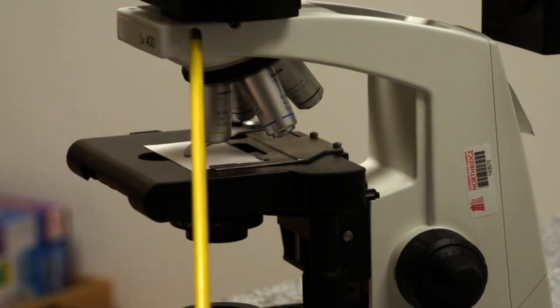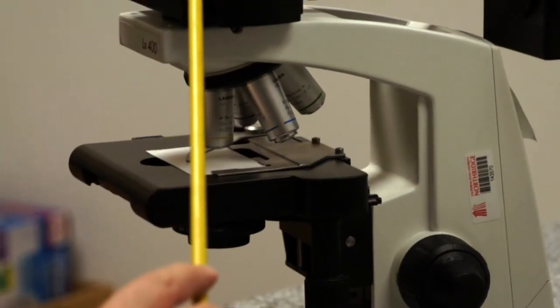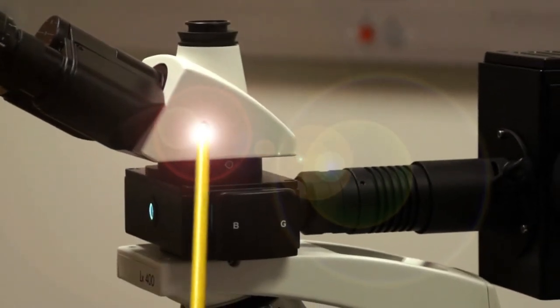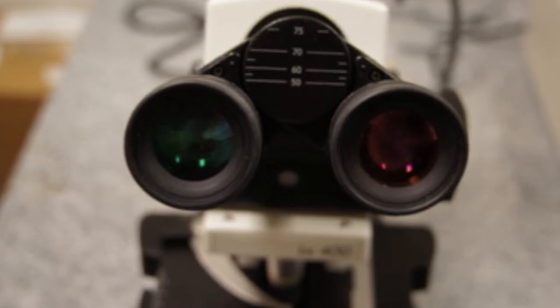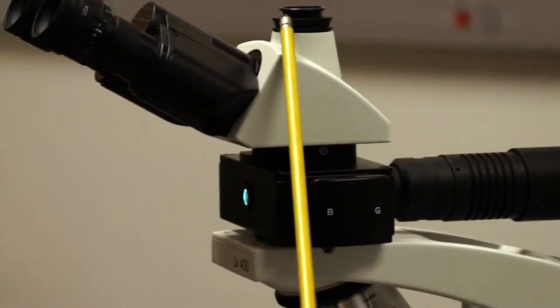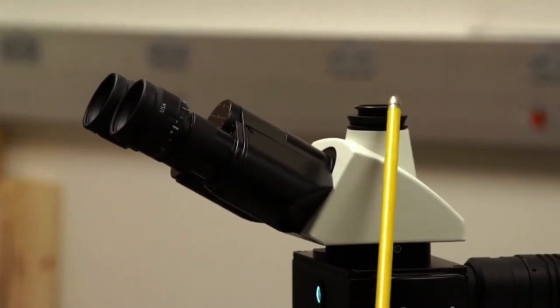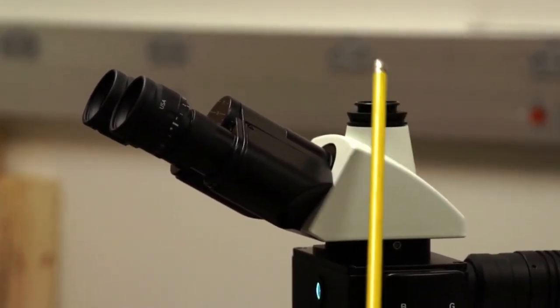It travels through the nose piece and up into the head of the microscope. This is called a trinocular head because you have two eyepieces for viewing and a third port to which you can attach a camera.